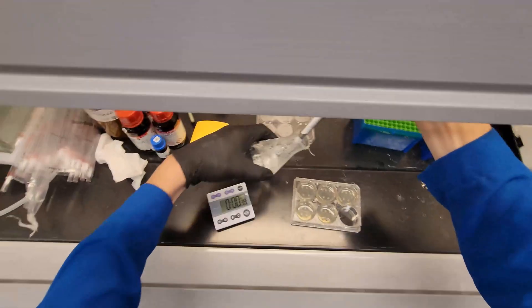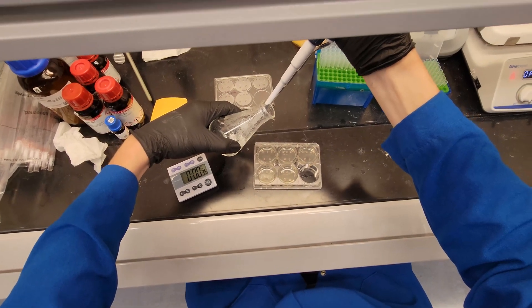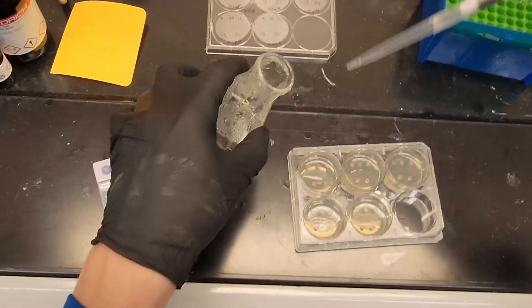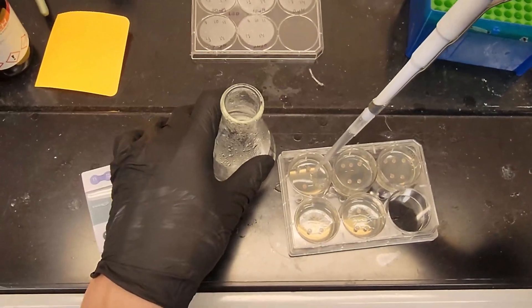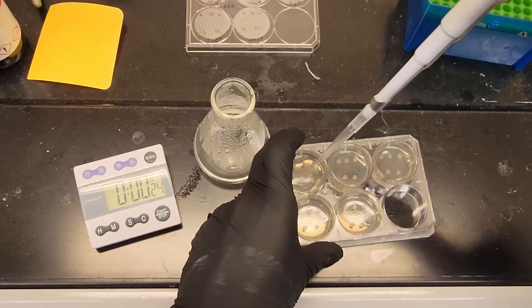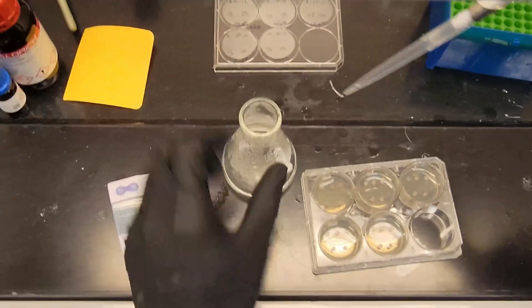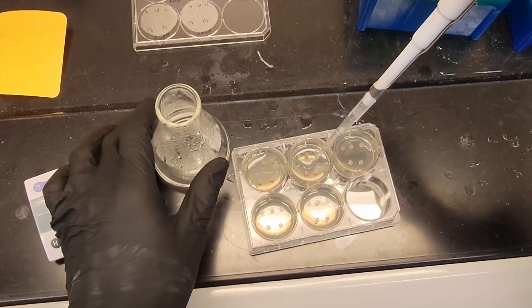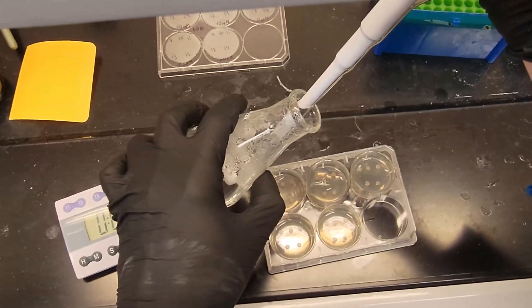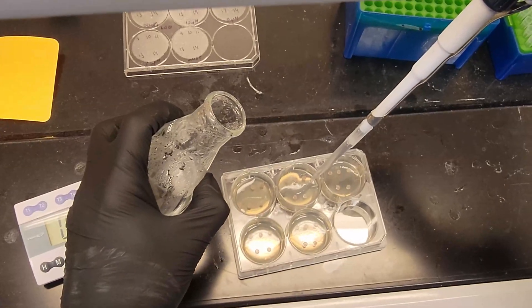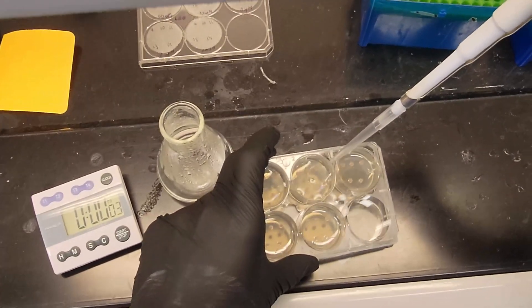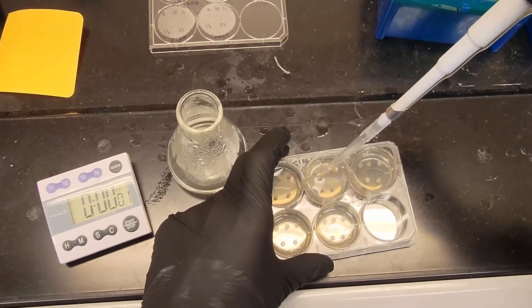Alright, so we want to use about two milliliters of this per well. Really, you should be able to do it with one milliliter, but in my experience, just going all out and using two milliliters is just safer. And you want to do this step very gently. You don't want to wash the cells around a bunch or your stains are going to look bad. You're going to have smears and stuff. So I'm adding pretty gently. Also, you know, I added the BME and the X-Gal while the solution was warm, not hot. That's another air bubble.